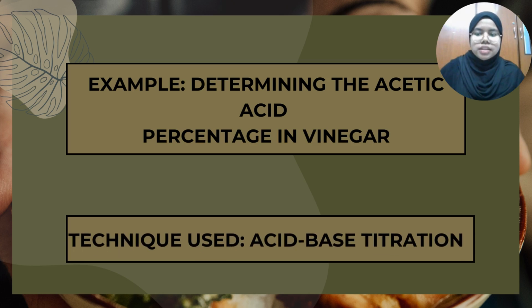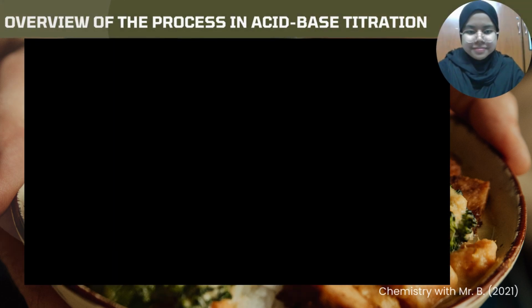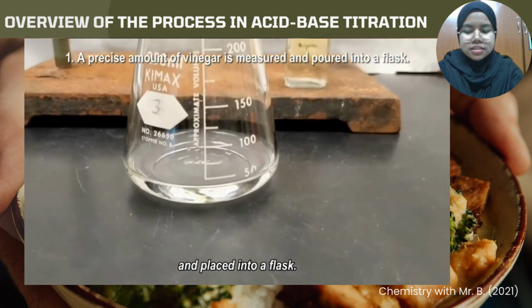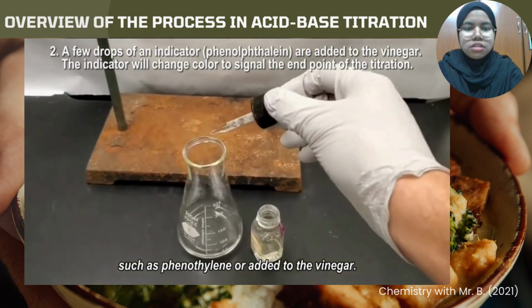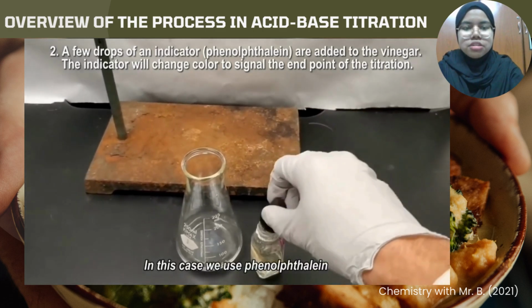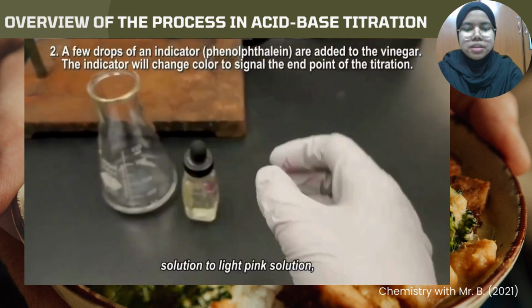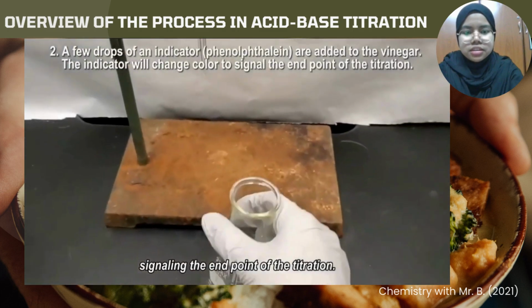Now, let's take a look at this example of acid-base titration in determining the acetic acid percentage in vinegar. Here's an overview of the procedure conducted in the experiment. A precise volume of vinegar is measured and placed into a flask. A few drops of an indicator such as phenolphthalein are added to the vinegar. In this case, we use phenolphthalein, so the indicator will change the colorless solution to a pink solution, signaling the endpoint of the titration.